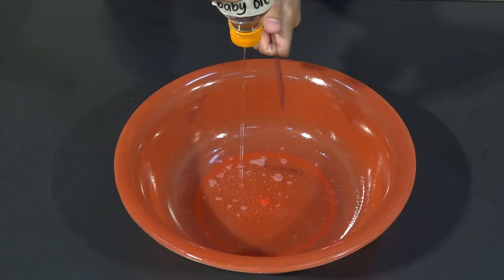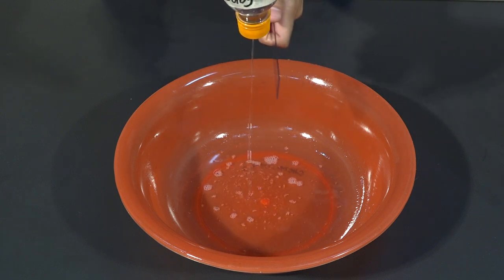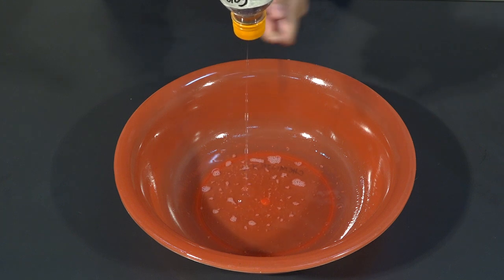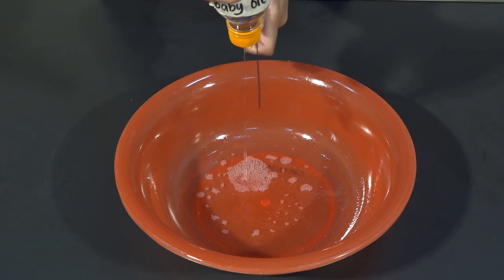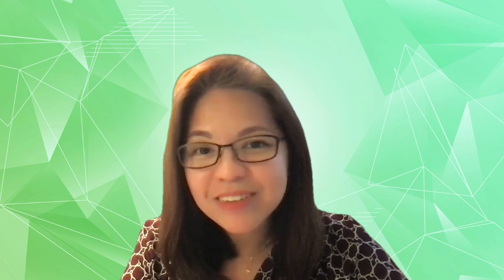Again, based on your observation, what could be the molecular polarity of baby oil? Did you observe the same movement of the baby oil as that in the movement of the cooking oil? How about with the movement of ethanol and water? Again, based on your observation, what could be the polarity of baby oil? That's it! We are all done determining the molecular polarity of our 4 liquid samples using a charged plastic ruler. Can you think of other liquids that would exhibit the same polarity as that of our four liquid samples?